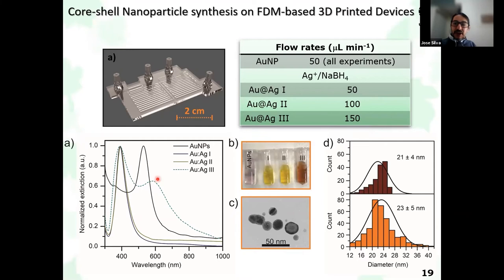This is an example of a metal particle, but you can coat the particle with different materials, for example, conductive or non-conductive polymer, or recognition elements, for example, aptamers, antibodies. So this is a general procedure, but it can be applied to many, many other situations. So you can see here the distribution of the gold nanoparticles. And here you can see the distribution after the reaction. We can see that a second distribution starts to appear here, indicating that the size is shifting to bigger nanoparticles.